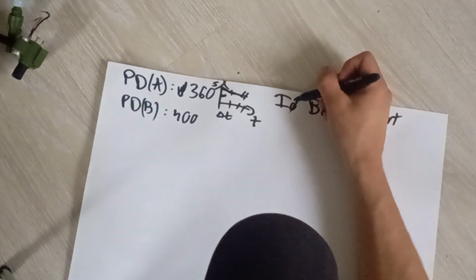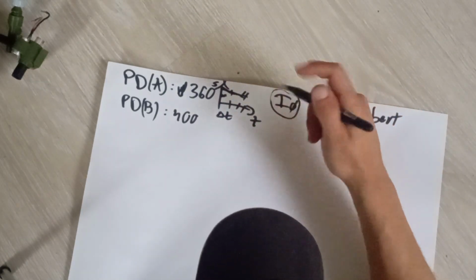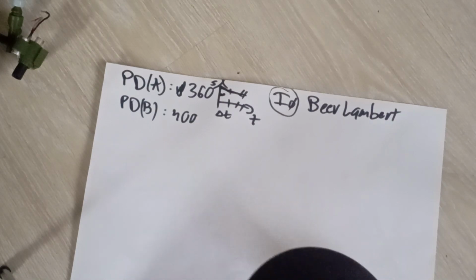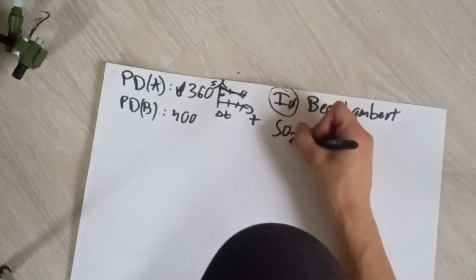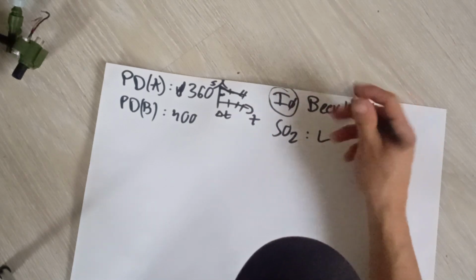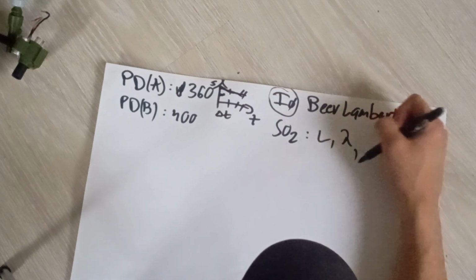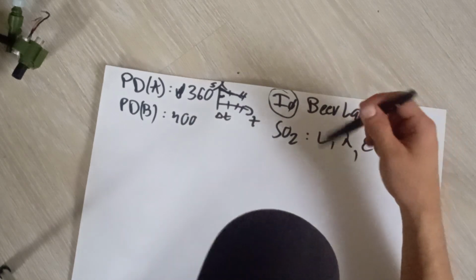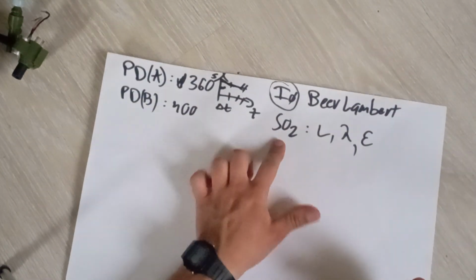You have a starting conversion, and you can calculate the concentration of the SO2 in the tube based on its length, the light it travels through, the wavelength, and the epsilon coefficient. So based on this, you can calculate the concentration.